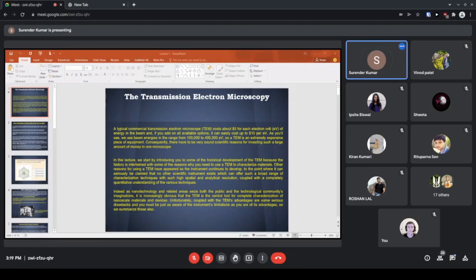It is not like you have something and you just put it in the electron microscope, because you are going to deal with electrons. So electrons should pass through your material. If your material is thick enough, then you will not get anything there. In addition to thinning them from the bulk state, particles and fibers of some of these materials are also commonly studied in such shapes. They are sometimes thin enough for direct transmission electron examination.